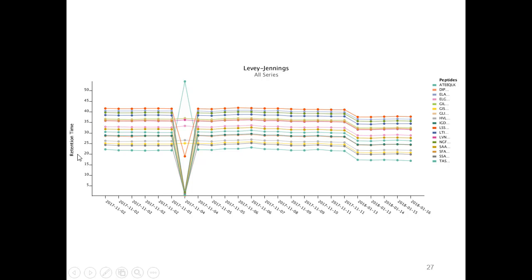My retention times on the y-axis looked pretty steady and then went crazy on November 4th, and then went steady again and then dropped a little bit. So if I was watching my AutoQC all the way through November and saw this one system suitability just go nuts, I would probably rush in and check my instrument and make sure nothing was wrong.